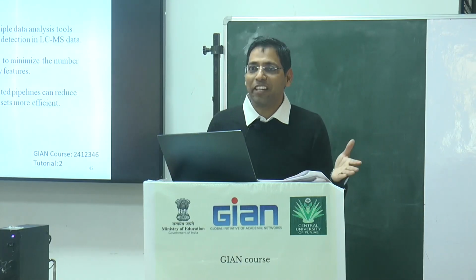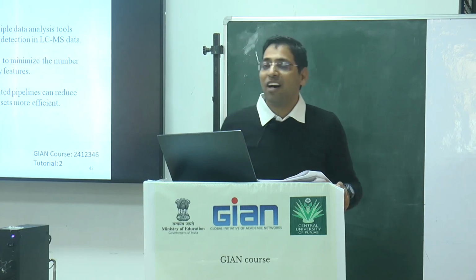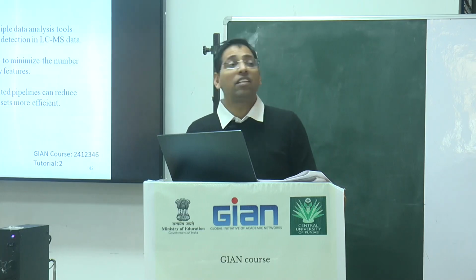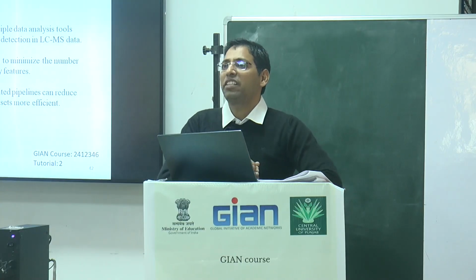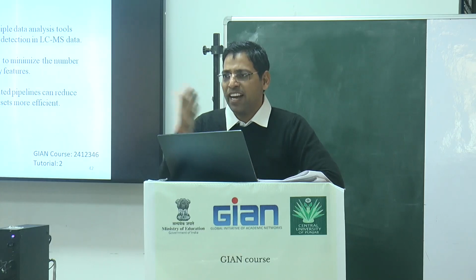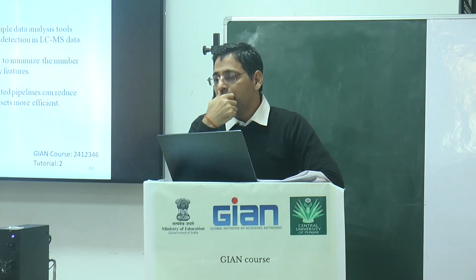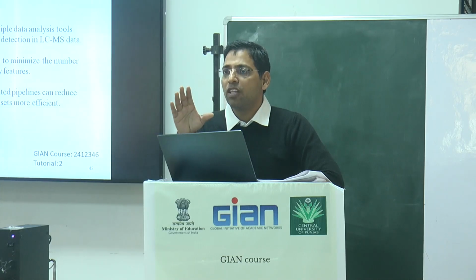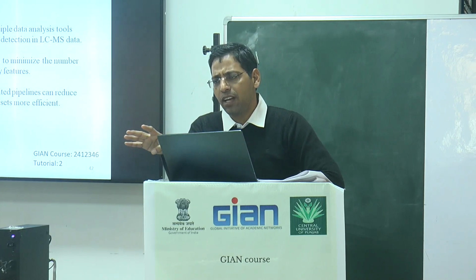Who is positive, who is negative actually. False positive, false negative. All India Radio, Doordarshan, The Hindu and the Indian Express contacted me. They told me we have to understand the meaning of false positive and false negative. I told them it is very difficult to say. If you analyze the data of that particular peak of the COVID qPCR, then only I can say. So we make a bar there, see the pattern, and we can say that it is positive and it is negative.